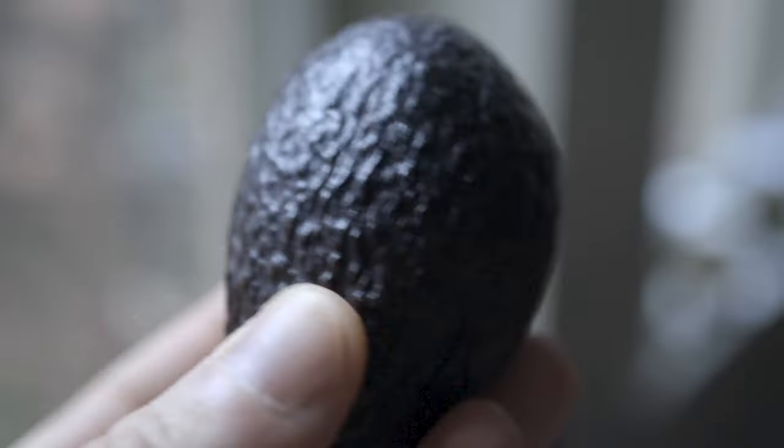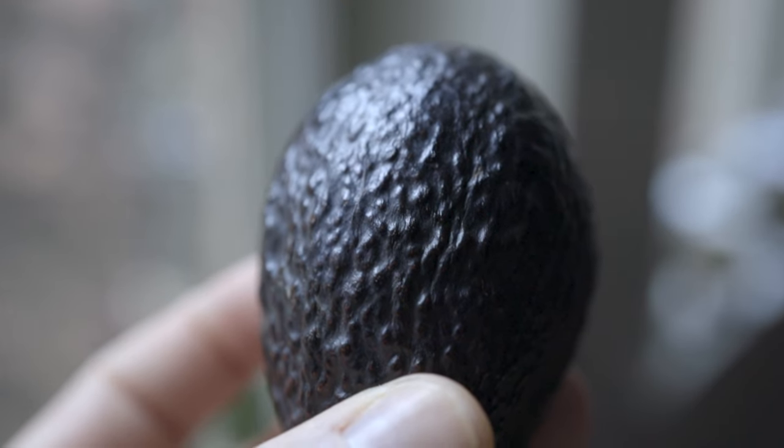This is an avocado. It has one of the weirdest skins. When you look at it closely, it resembles the skin of a humpback whale.